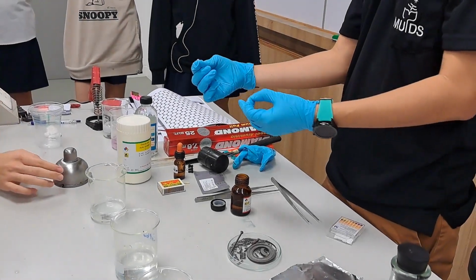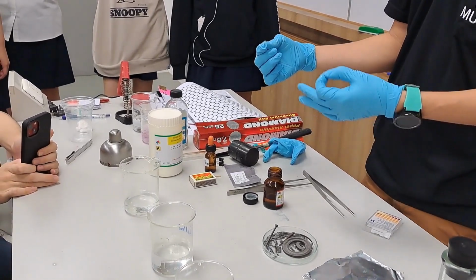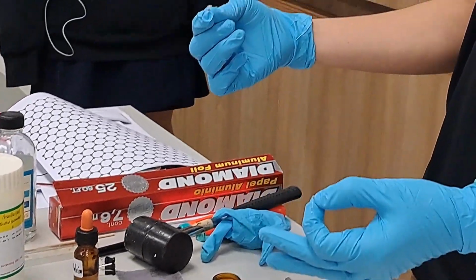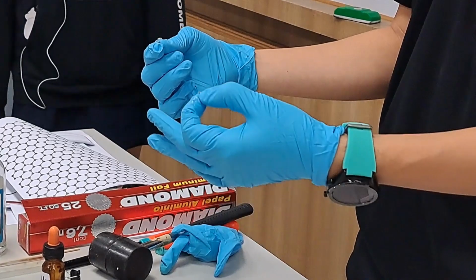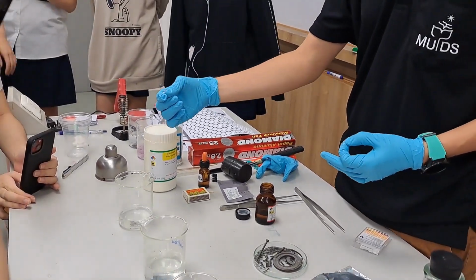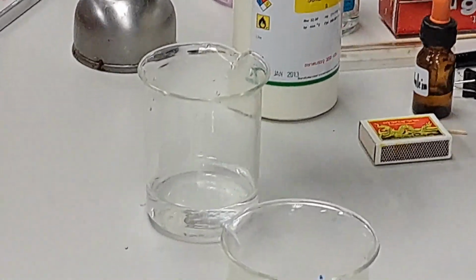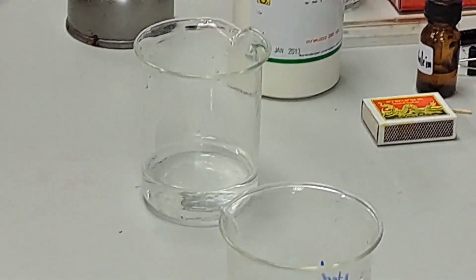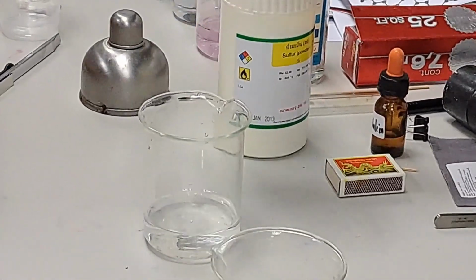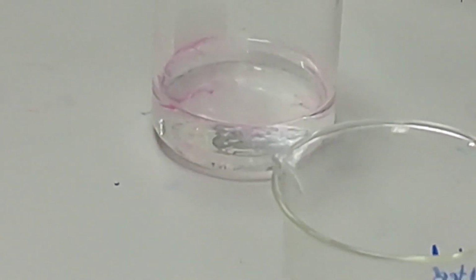Phenolphthalein is an indicator for base. If the solution is base, it turns pink. If it is acid or neutral, it is clear, like tap water. Count down first. 3, 2, 1, go. Oh, not dropping inside. 3, 2, 1, go. So it runs on top of the water surface.